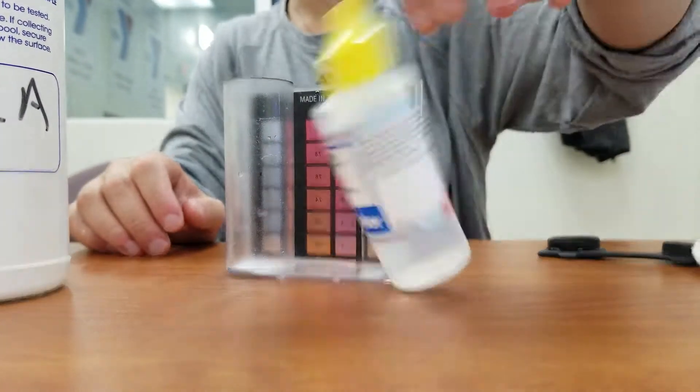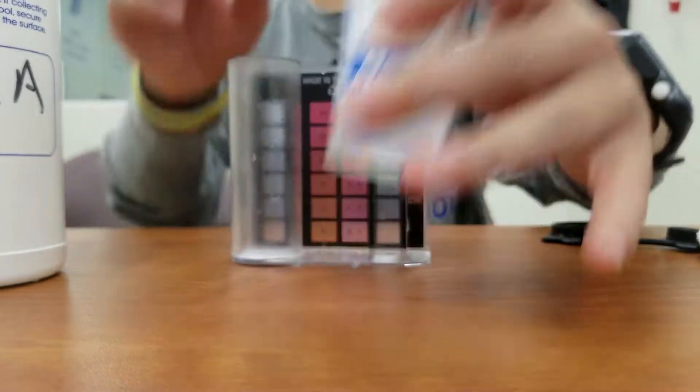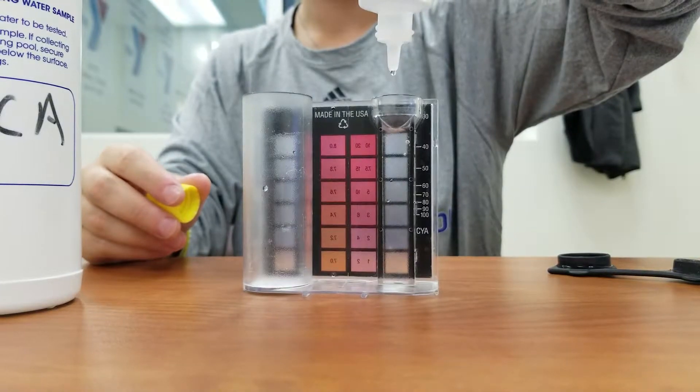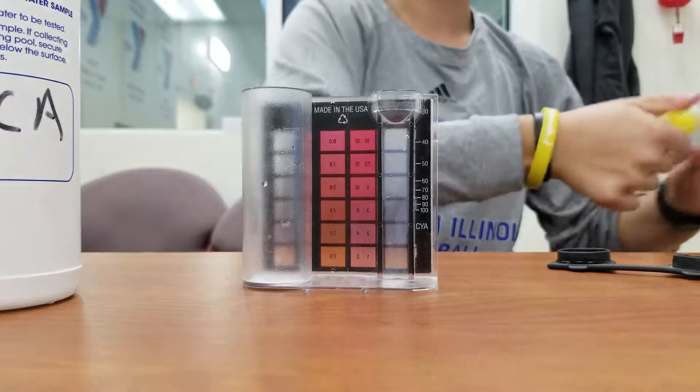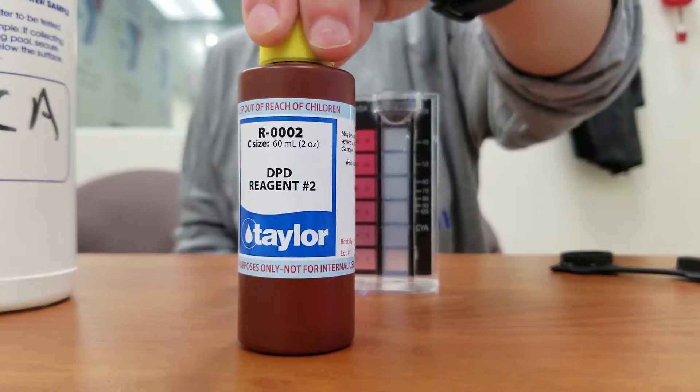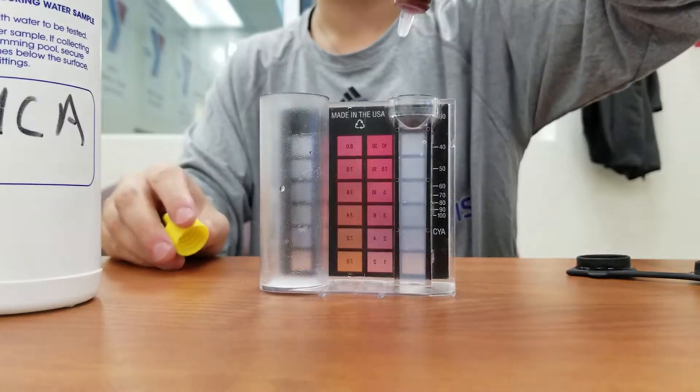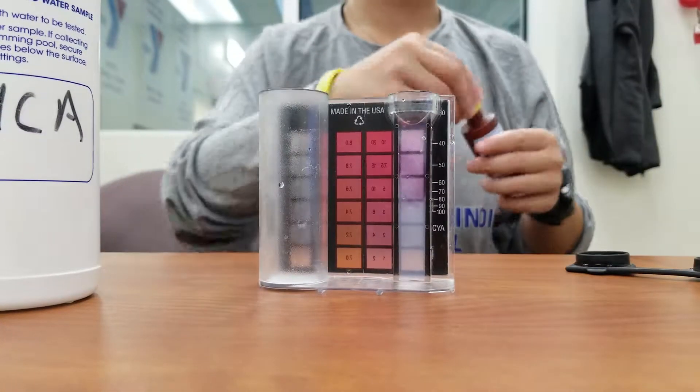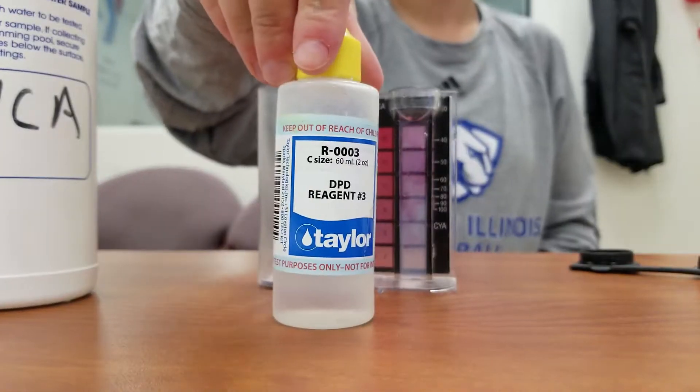We're going to take five drops of R001, reagent number one, and add it to the solution. Now we'll take five drops of R002 from the brown bottle, cap it, and shake it.